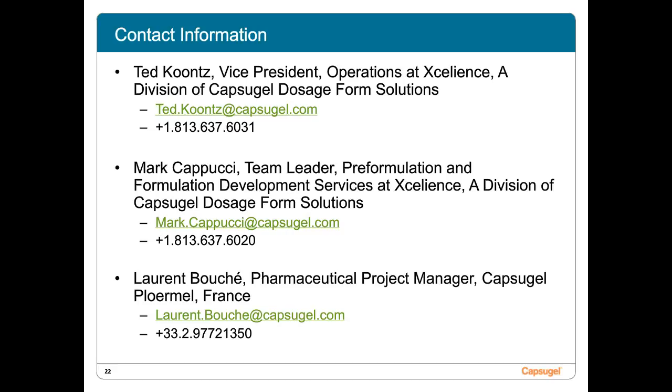so that when we're moving on into the Xcelodose, we at least have some of the information to help with picking out the proper dispensing head and then picking the proper tapping frequency. As mentioned a couple times throughout the course of the webinar, the material is sitting in the hopper and there is a tapping arm that is tapping the dispensing head, making sure that the material is flowing properly through that. We're not seeing any bridging, we're not seeing any rat holing, and some of the other aspects, to make sure that the material is flowing and to keep the process moving forward.